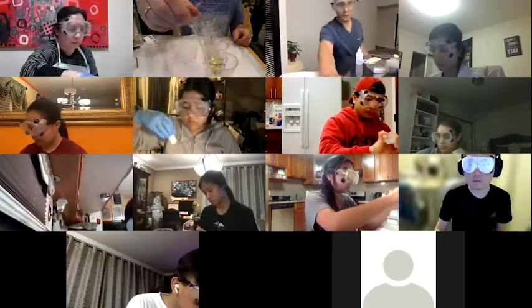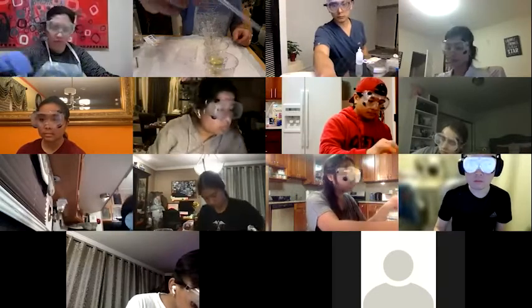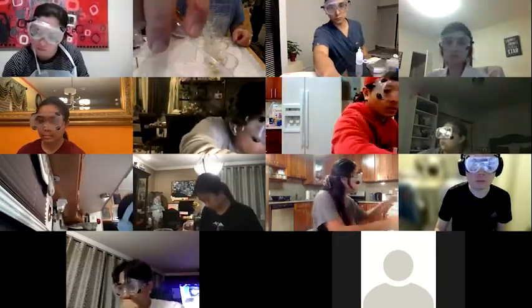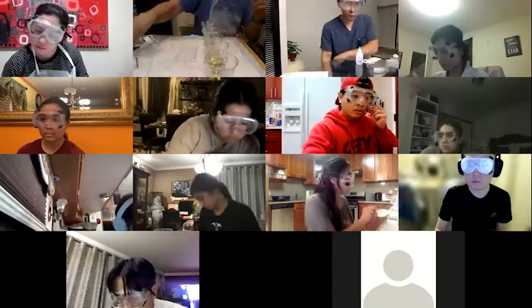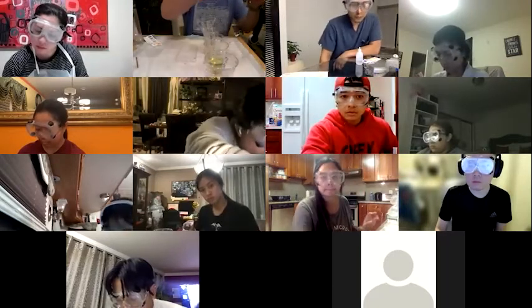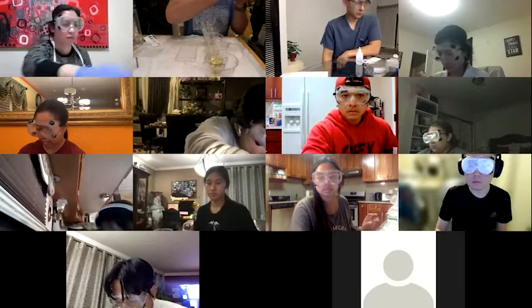So remember, the 1 mil mark is just below the bulb. It's right there. You could even take your marker and mark it to make it a little easier to see. It's probably not a bad idea.